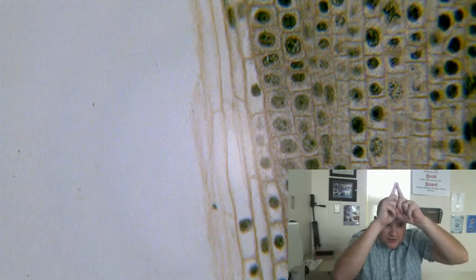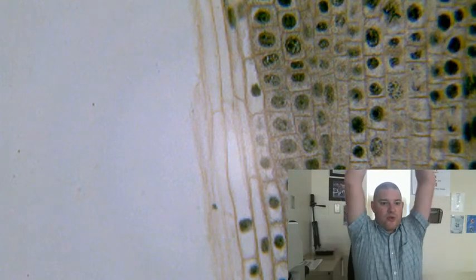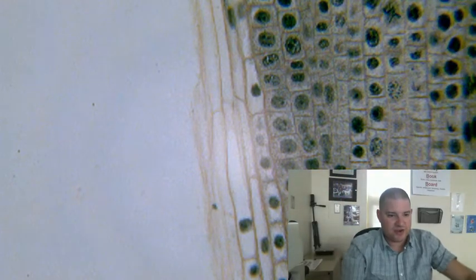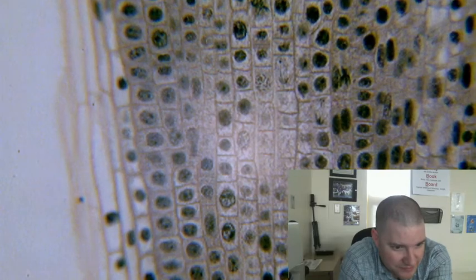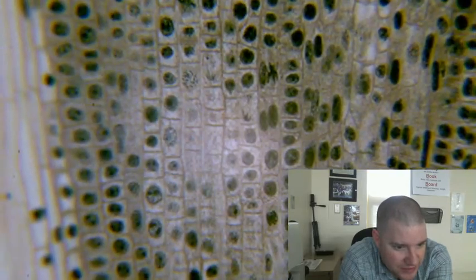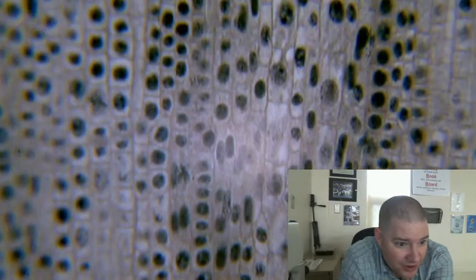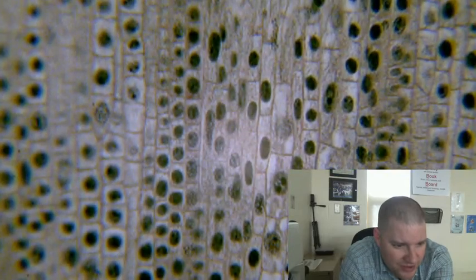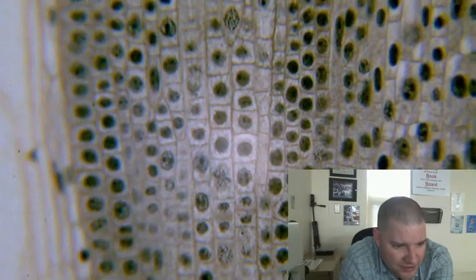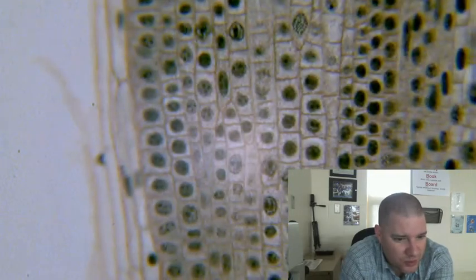If you go in this row, or I guess this would be a column, and you go all the way up to the very top, you can see that they're lined up in the middle. There would be a good metaphase happening. Let's see if we can find a good telophase. Telophase is maybe a little bit harder to find because it's hard to get a picture of them right before they split. So a lot of these telophases are just going to be hard to see because they pop right back into interphase so quickly.